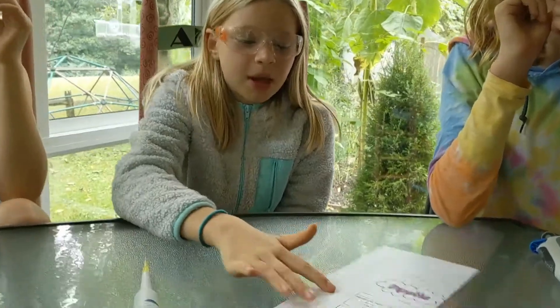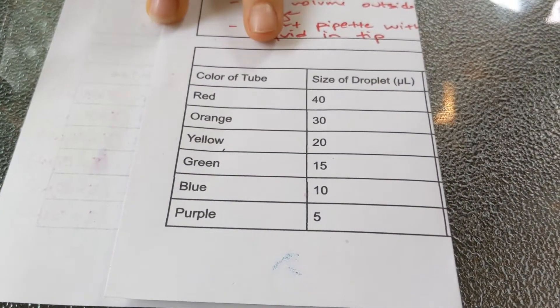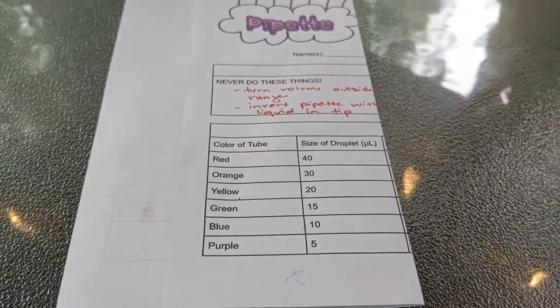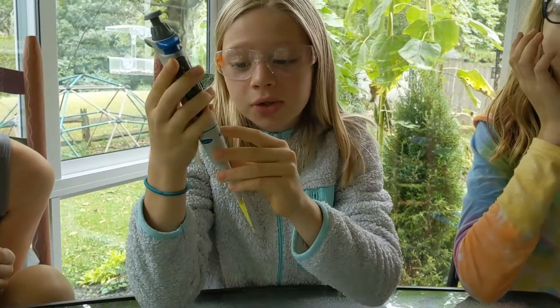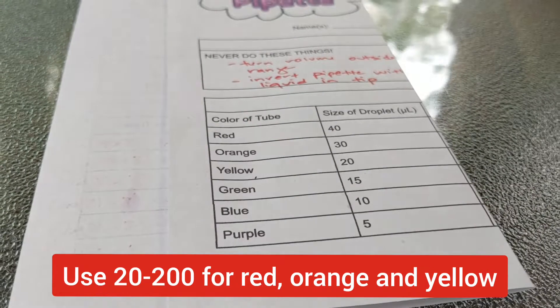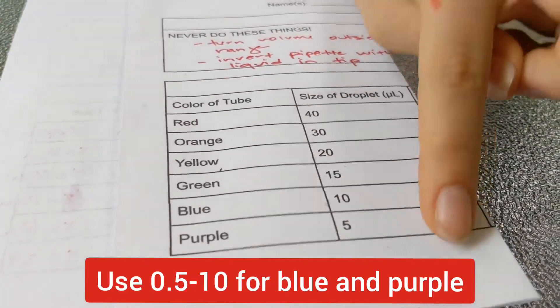On the paper there is a chart that says the color of tube and the size of the droplet. Here is where the micropipette numbers come in: the 20 to 200 micropipette is for volumes of 40, 30, and 20, and you would use the 0.5 to 10 for 10 and 5.